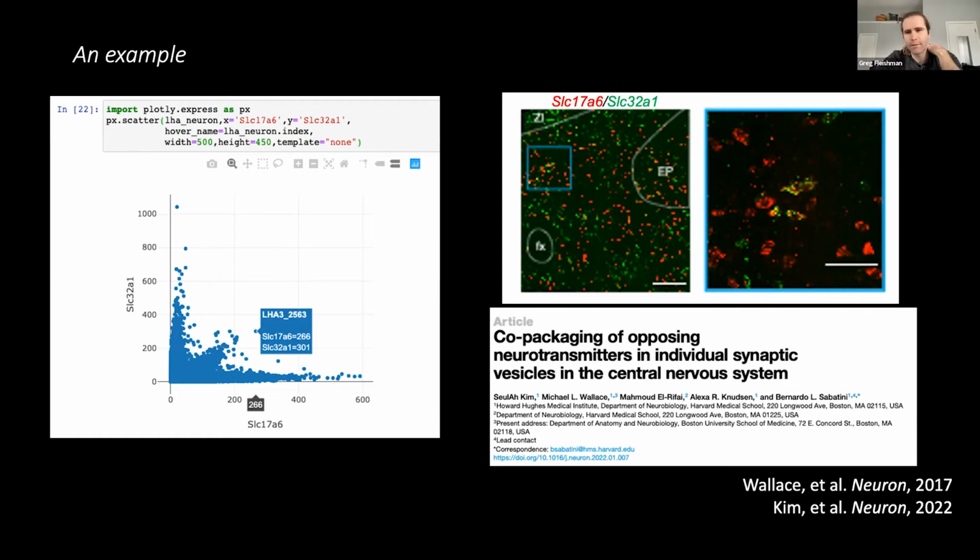We have seen the same thing in the whole brain zebrafish, by the way. Because we looked at the same comparison, excitatory inhibitory, with the expectation that they'd be mutually exclusive, and to a large extent they are. And in at least one case, this test did reveal a problem with the sample preparation, where a harsh stripping of the probes actually caused some fragmentation of the spots, and they became more widely distributed throughout the brain. And that mixture of these two cell types was artifact, right?